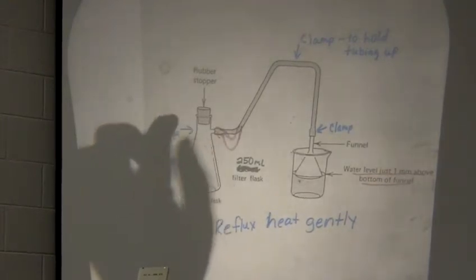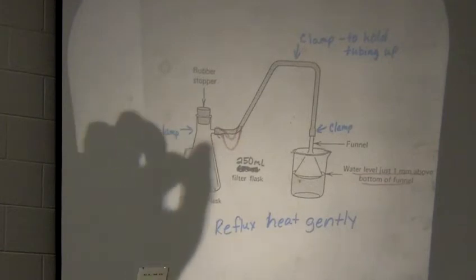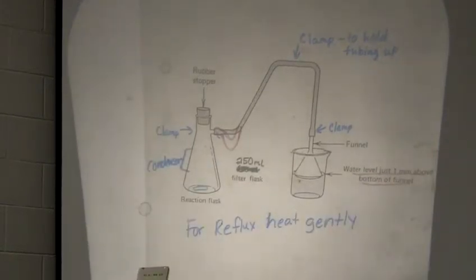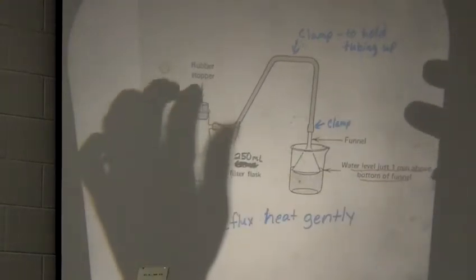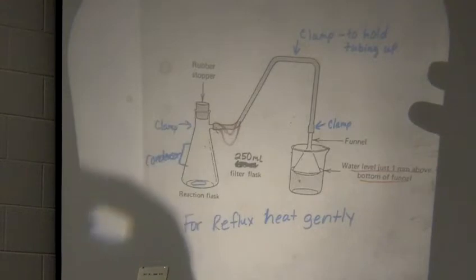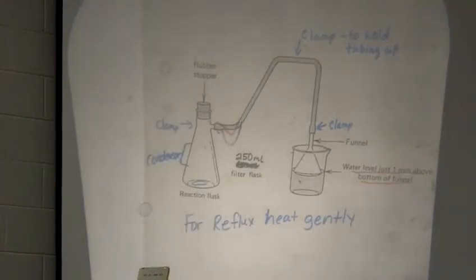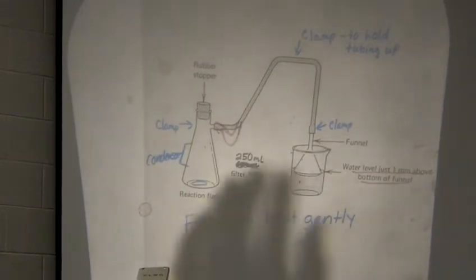And you want to make sure that you're flat on your stir plate when you're setting things up, okay? The people that are starting at 0 degrees are going to set this up in their pan. The people that are starting at reflux are going to set this up directly on your hot plate, okay?